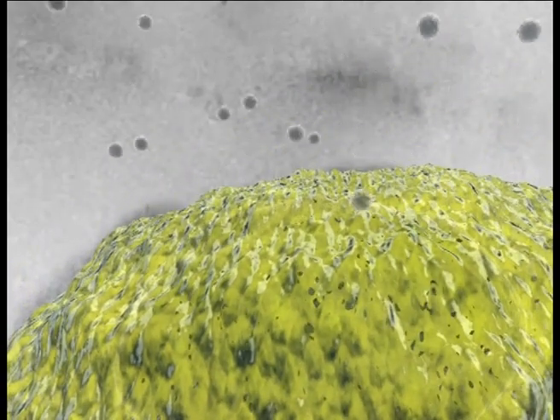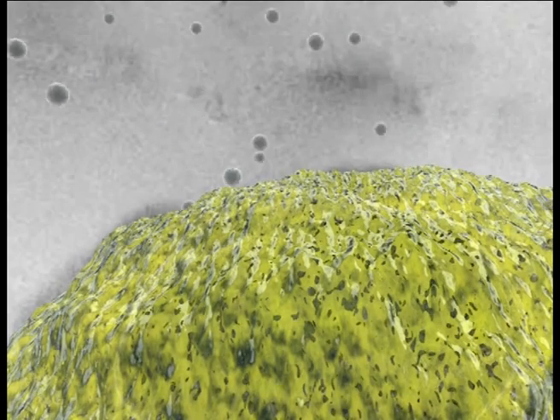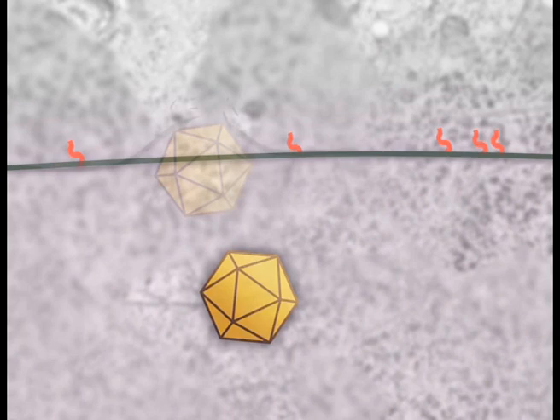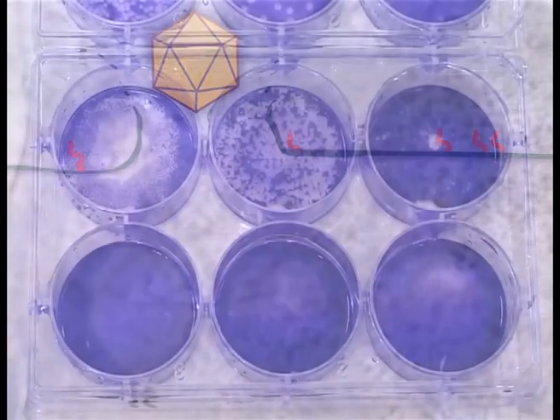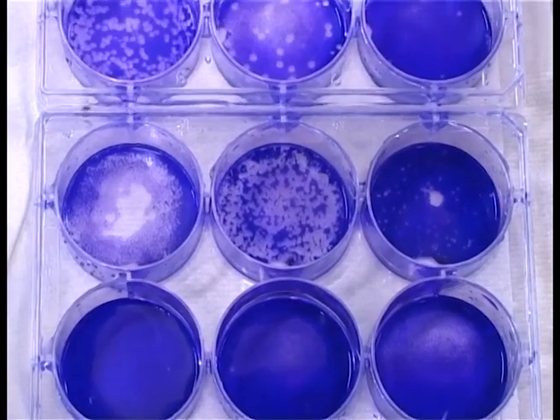The replication of viruses in cultured cells can often be detected by comparing the infected and ultimately dead cells with the normal ones. This is the so-called cytopathic effect, and it can be used to detect and quantitate virus infectivity in a plaque assay.